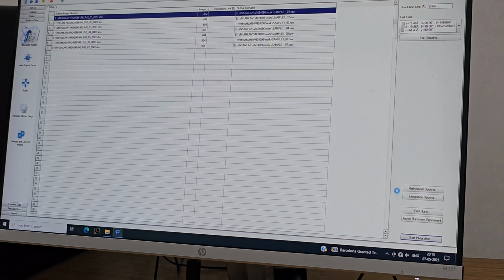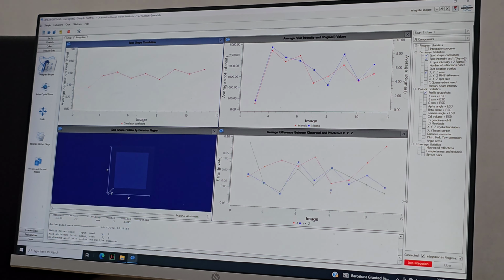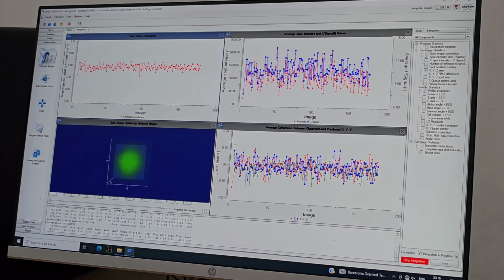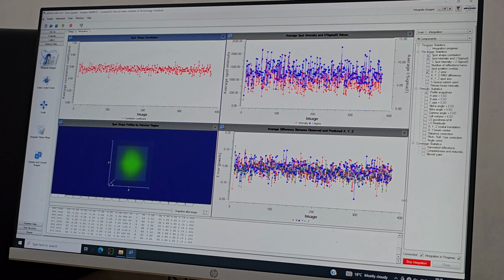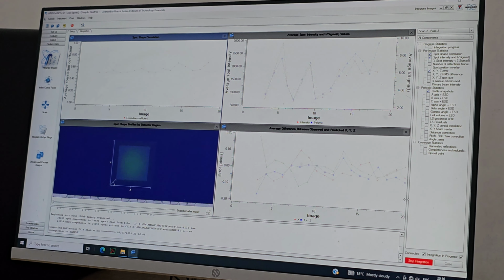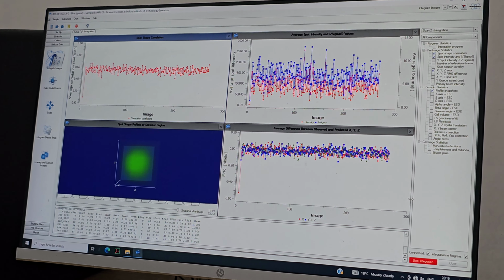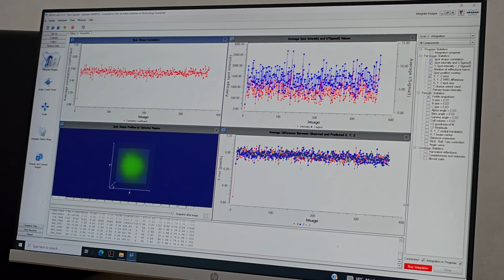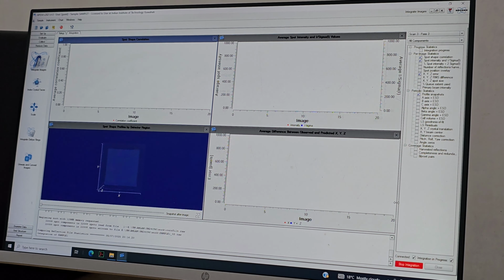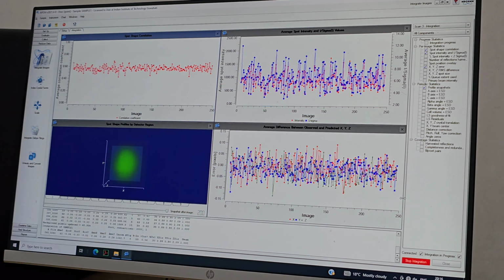Then it will integrate all the images, all the spots present in all frame images and all frames. So you can see there is some progress of integration. Now I will show you the integration process in real time, by which you know the actual time it takes to integrate all the images. Now the data quality is average, you can say good quality.